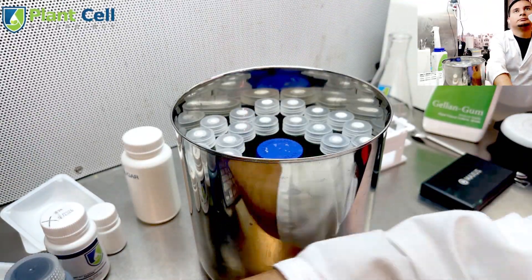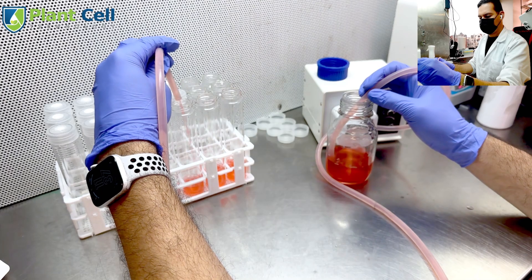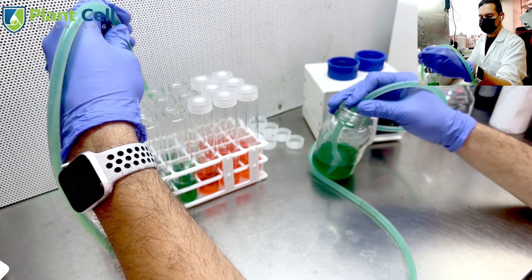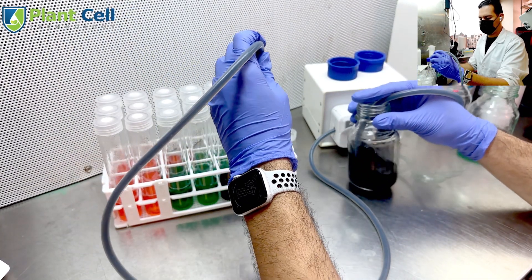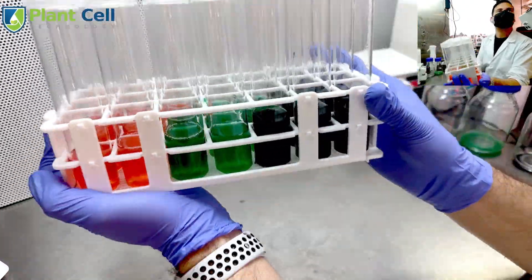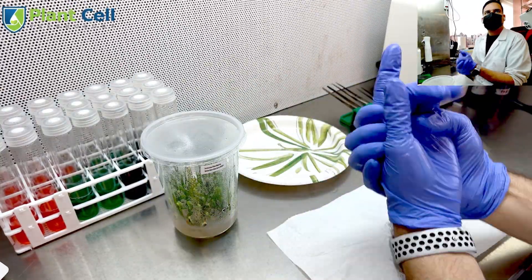Next, I move all the test tubes and the jars into the sterilizer. I need to sterilize the media — first to dissolve the gelling agent, and second to sterilize everything so no fungus or bacteria grows in the media after everything is set. Then I use a pump to add the exact same amount of media to each of my test tubes.